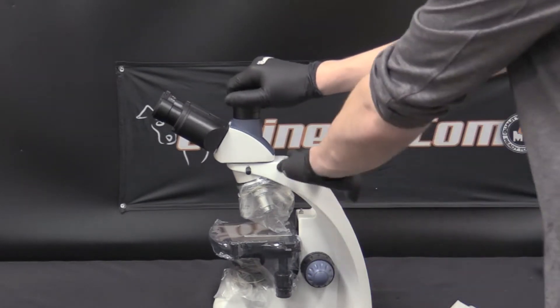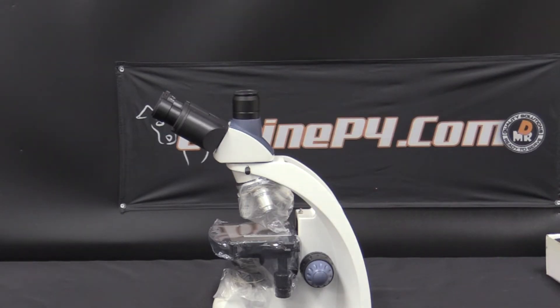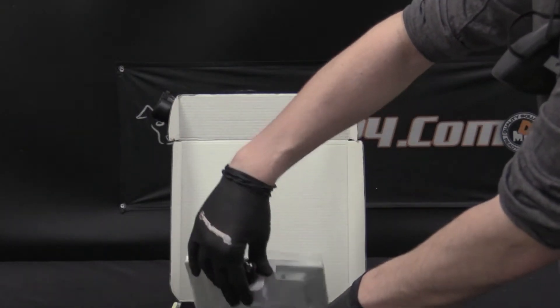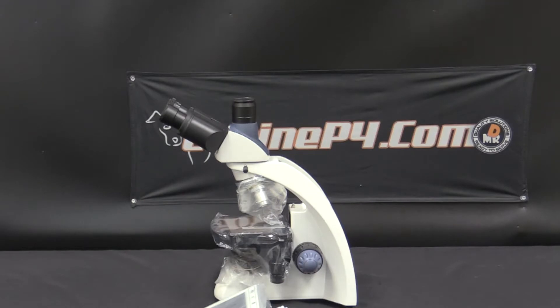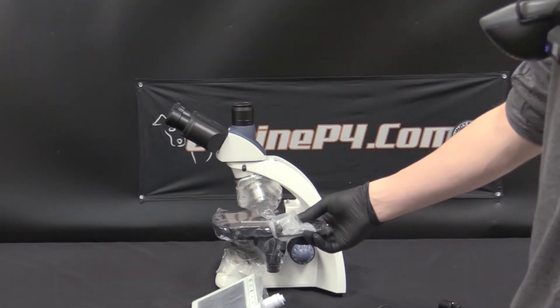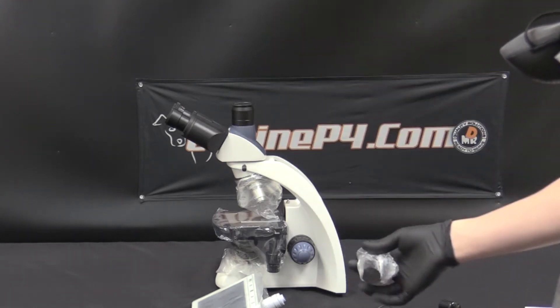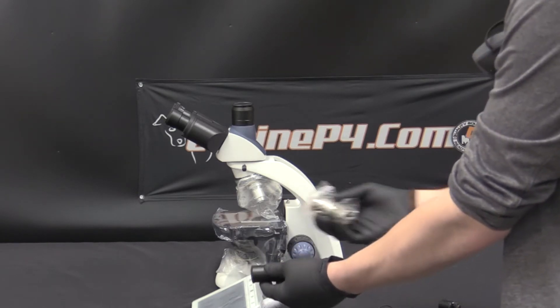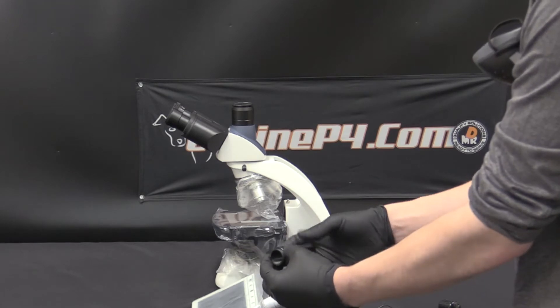Next we're going to install the LCD screen. To do that we'll take the cap off of the top here. The LCD screen comes boxed separately. We'll take out the screen and its power cables. Included with the microscope package contents is a coupler or fitting which attaches the LCD screen vertically into this chamber. It looks similar to your eyepieces, just notice how it's much longer than the actual eyepieces and can be screwed into the base.